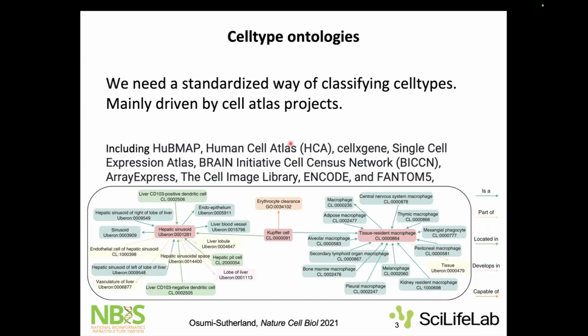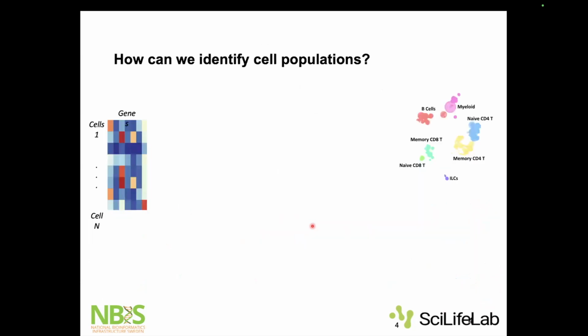In the latest paper that I was reading about cell type prediction, they are really using this ontology. So if you want to use a reference data, you have to turn it into something like this, and then you will be able to use their method.